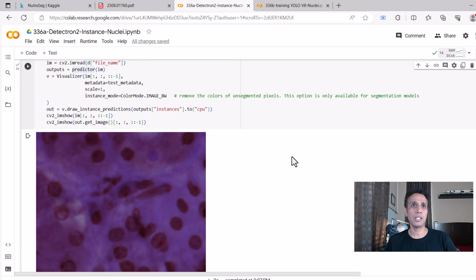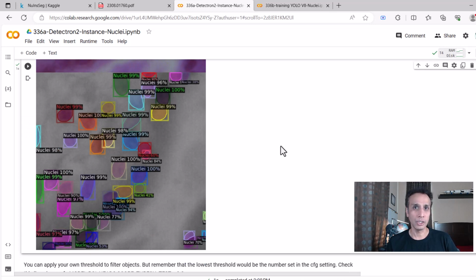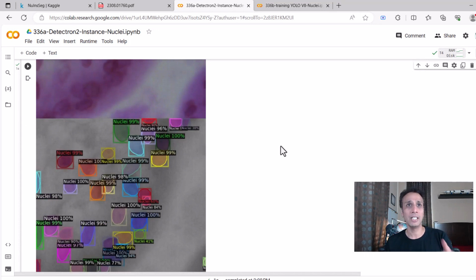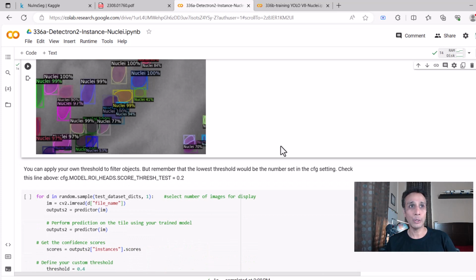Go ahead and check this on a few. Maybe it fails on the next one. Let's check. I don't know how good this is. Oh, it's actually doing a good job. So I could claim that I know this model is great, and then move on. But we have a quantitative way of actually doing that, right?